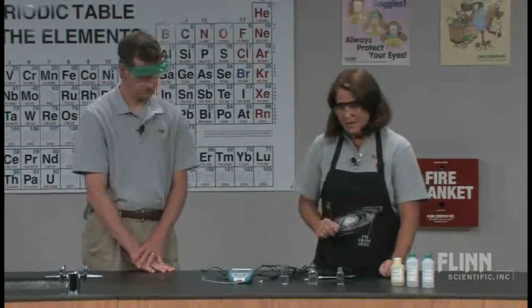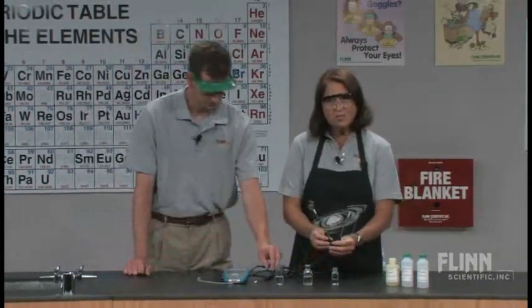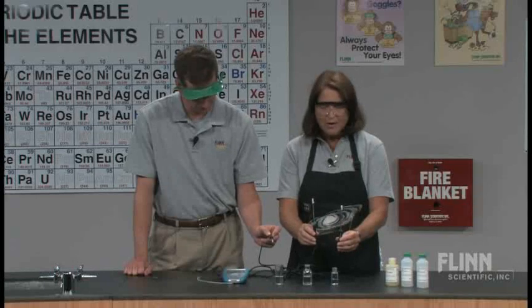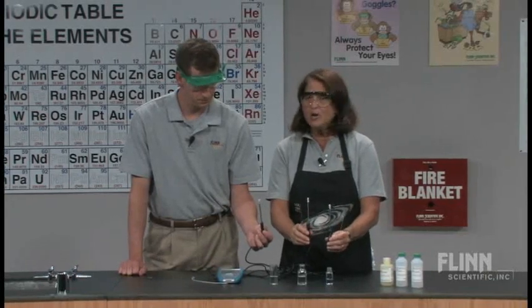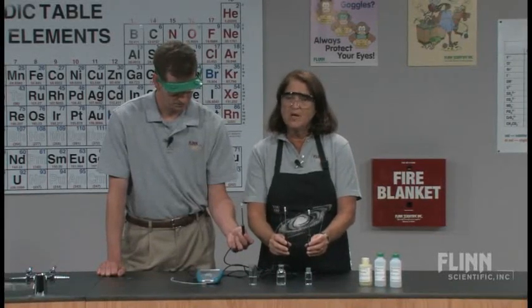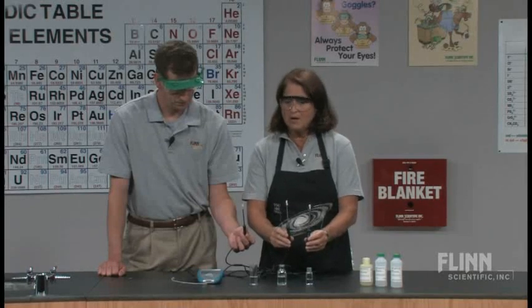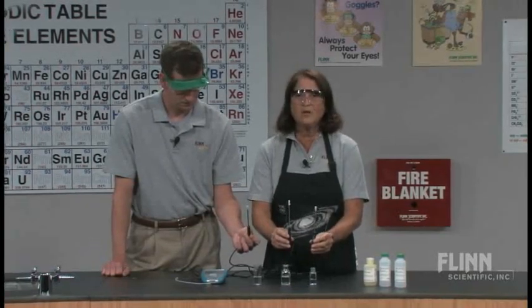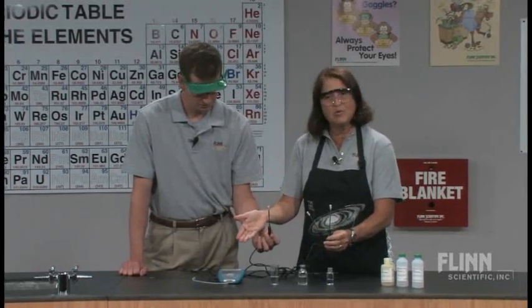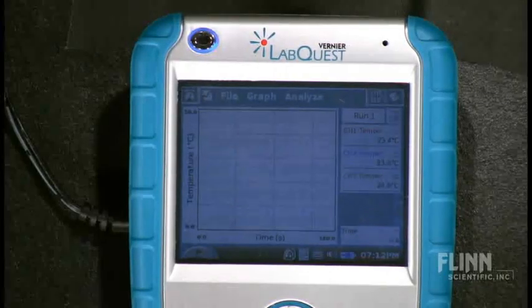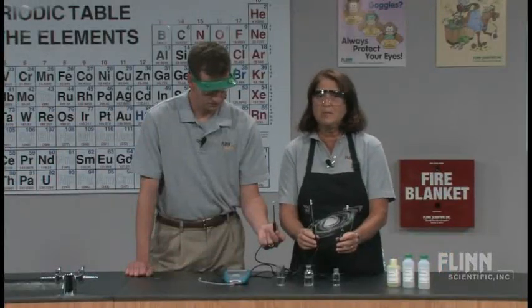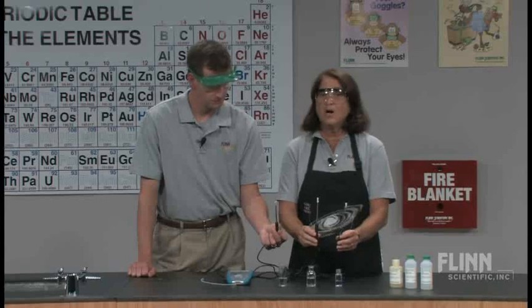The instructions are: take the probes, dip them into the alcohols just to wet the tip and soak the paper towel, then pull the probes out all at the same time and lay them down. I don't want my students holding the probes — all three have to be in a similar location and positioning. As soon as that's done, we go to the LabQuest. Mike has set it up to take data from all three probes, recording changes in temperature. We're going to take data for 120 seconds.